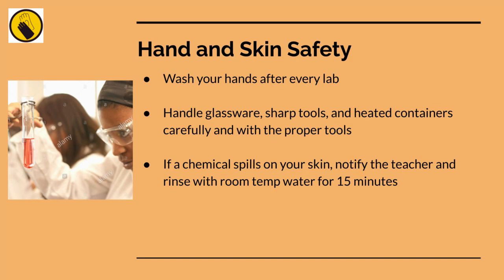If it's Kool-Aid, go rinse it off, wash your hands, get back to the lab, and continue. If it's something a little worse than that, I know the procedures on how to best wash your hand up. You need to let me know, and then we're going to go through the steps as to what will happen next. Typically, with most materials we use in here, the best thing you can do is just rinse your hand under room temperature, cool-ish water, not cold water, and definitely not hot water, for about 15 minutes.